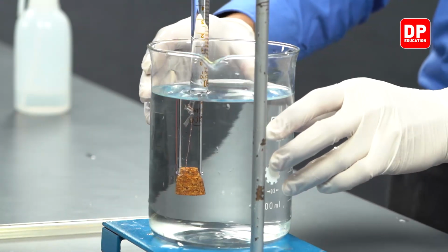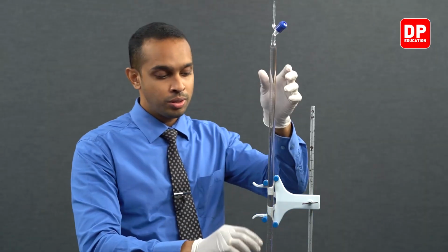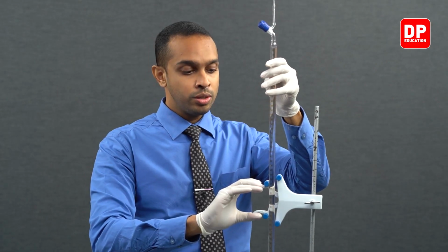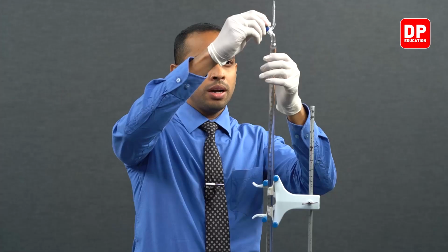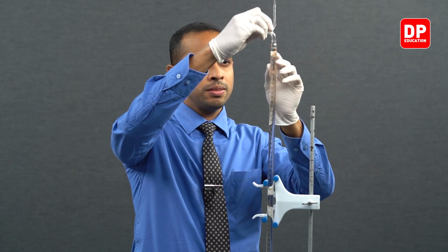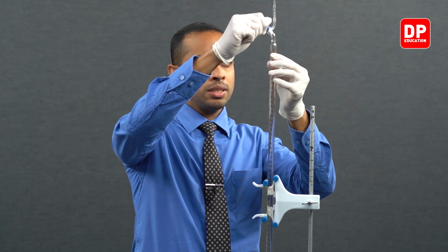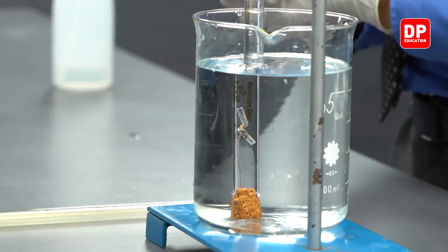You can see the reaction has not yet started because HCl is slowly going down towards magnesium. We do not see the formation of any gas bubbles. So during this time, we can align the water level of the burette with the 50 milliliter line that we have here. We have our 50 milliliter line, so we are going to align the water level with the 50 ml line.